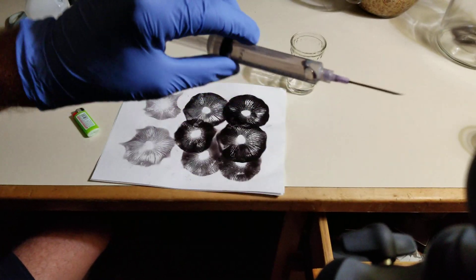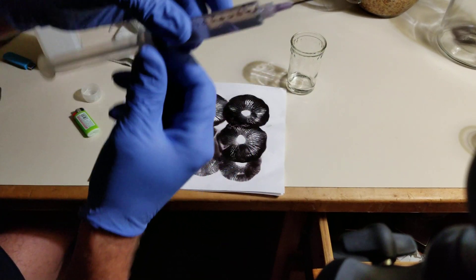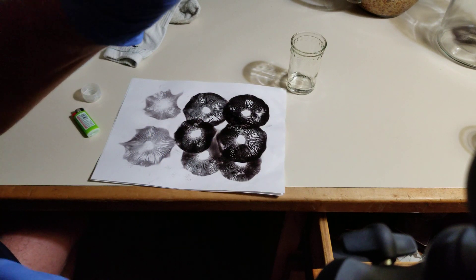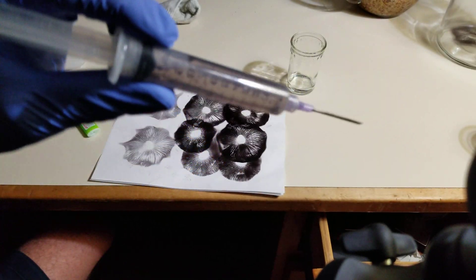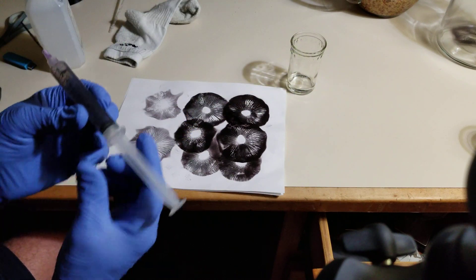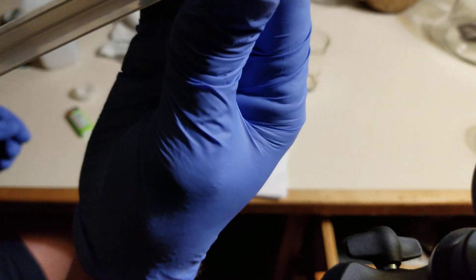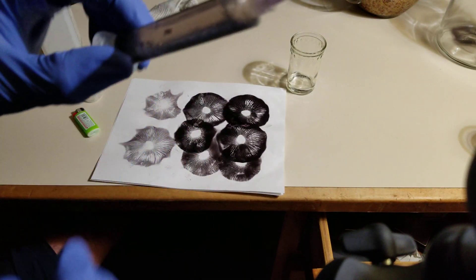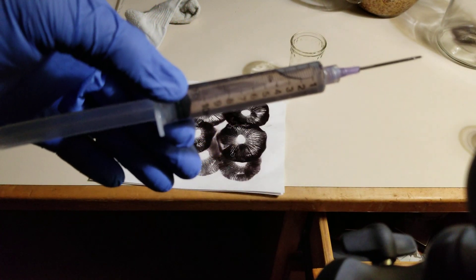The spores are in mass. I want to shake it. And you can see the purplish colored spores.